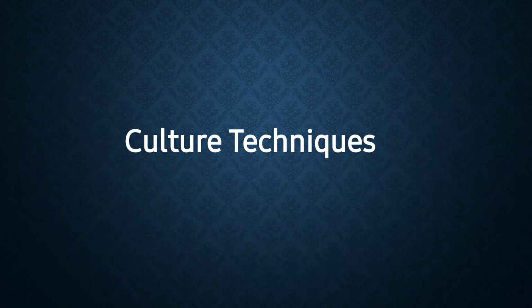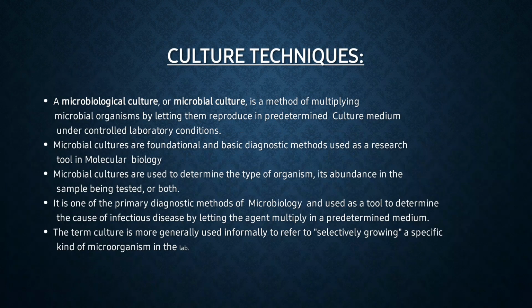We are going to learn about culture techniques. What is culture technique? A microbiological culture or microbial culture is a method of multiplying microbial organisms by letting them reproduce in predetermined culture medium under controlled laboratory condition, that is in vitro condition.